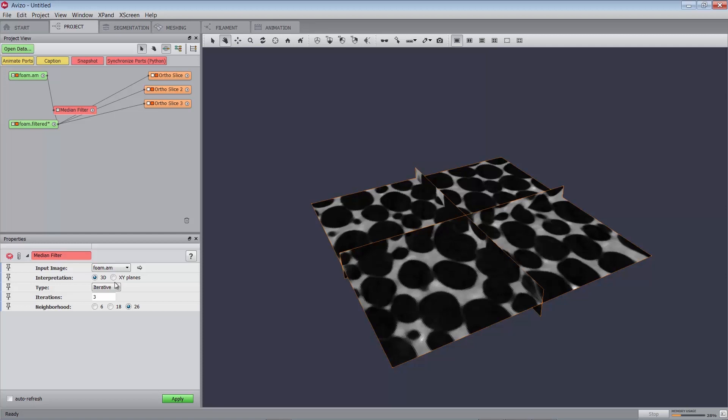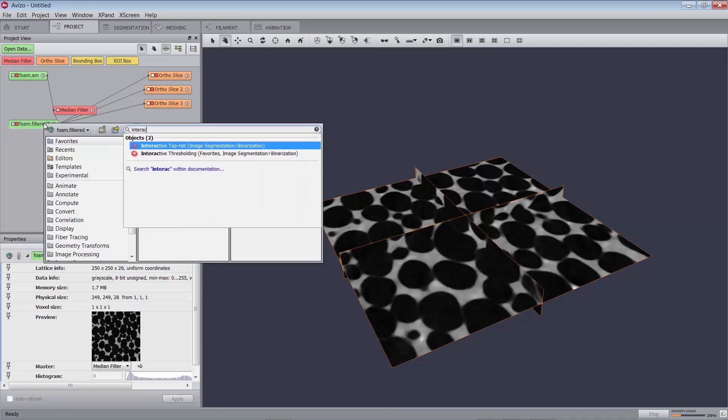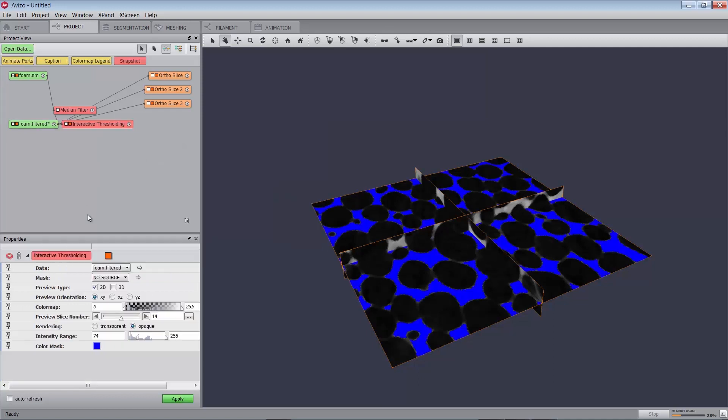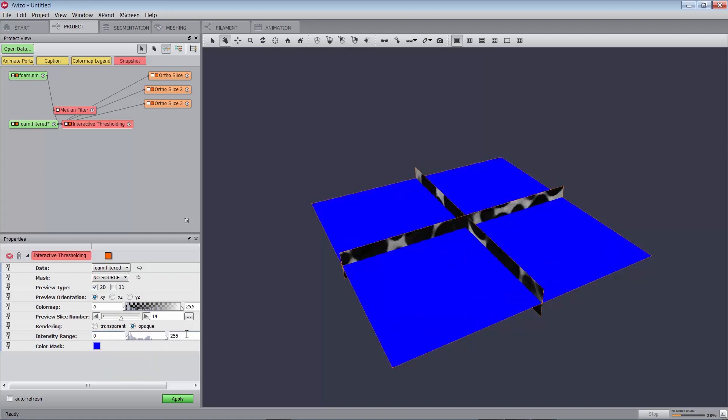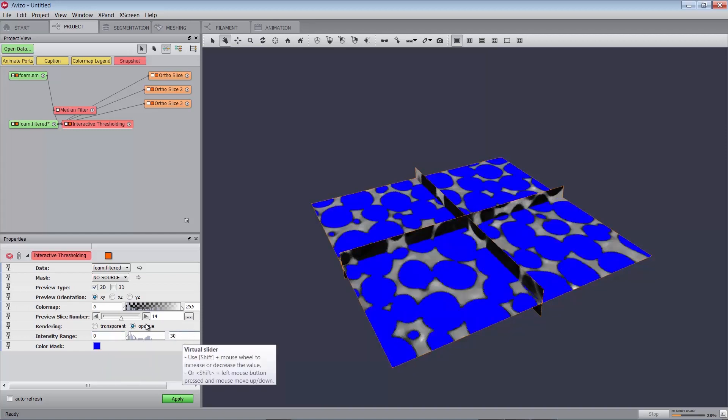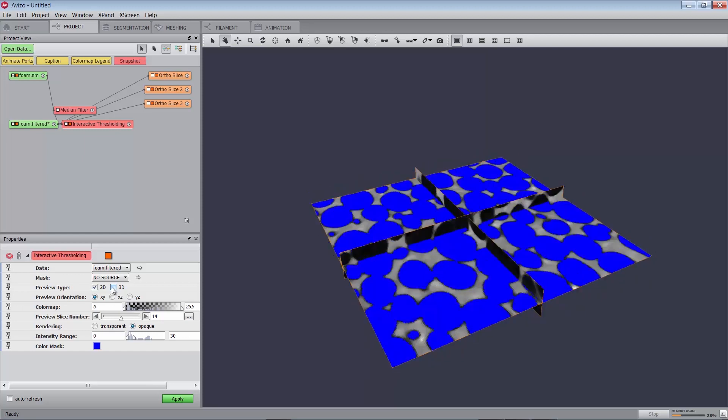Threshold binarization can be done with the interactive thresholding module, which enables you to set the levels with visual feedback. Let's attach an interactive thresholding module to the filtered data. You can interactively modify the threshold values with immediate 2D or 3D visual feedback. The selected pixels appear blue in the displayed image. In the properties panel, you can set the intensity port to range 0 to 30, for instance. Check and uncheck the 3D option and the preview type port to get a 2D only or 3D preview. Press the apply button to start the module.